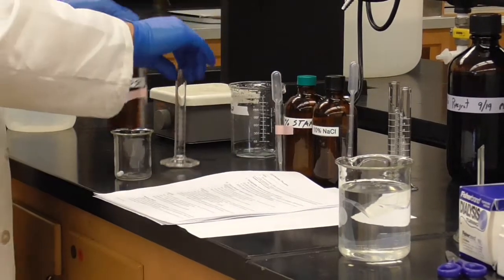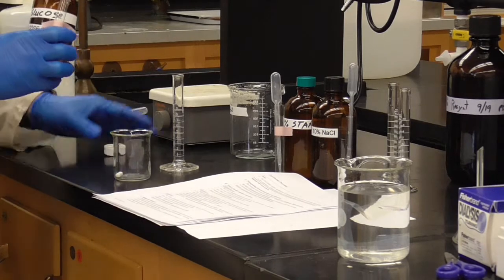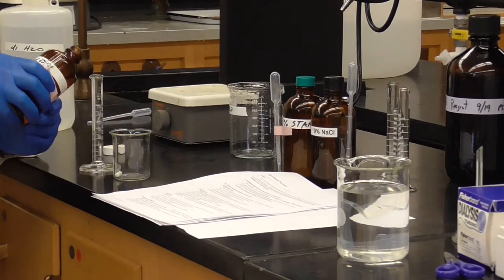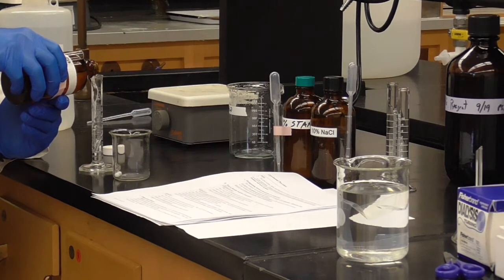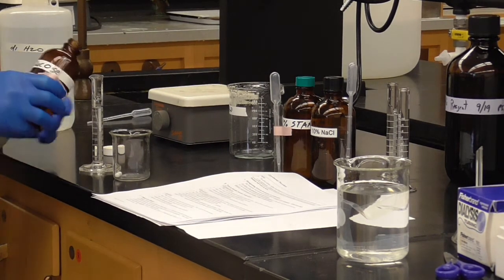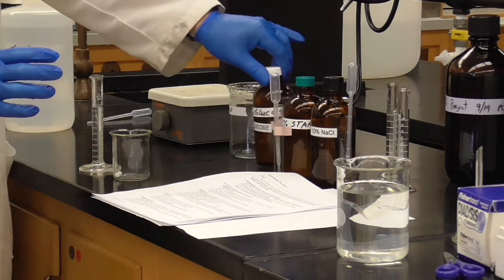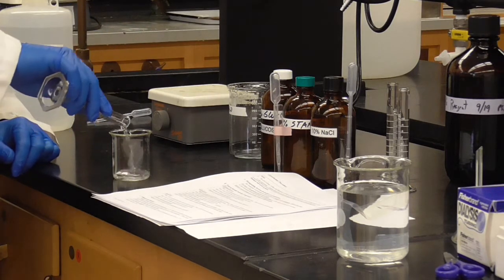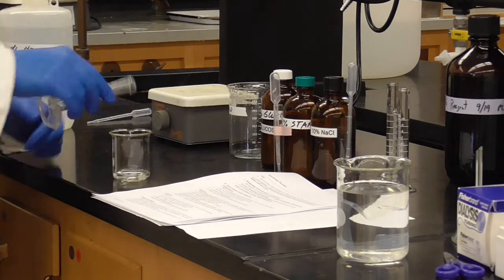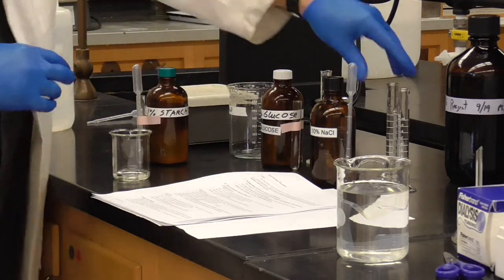So let me just do this one at a time. 10 milliliters of the glucose. As long as I get approximately 10 milliliters, that will be fine. It doesn't need to be right on, because again, we're just doing this as a qualitative test, so we can see if it's present or not. So there's my glucose solution. The second one is the starch solution.